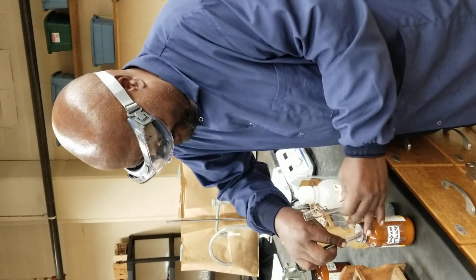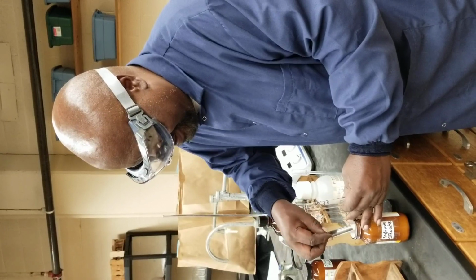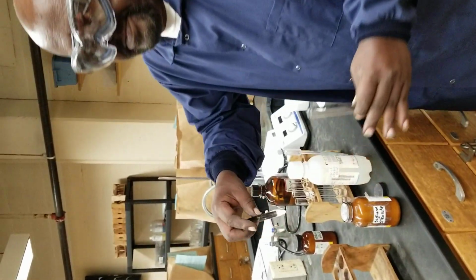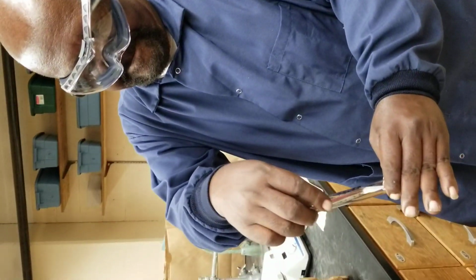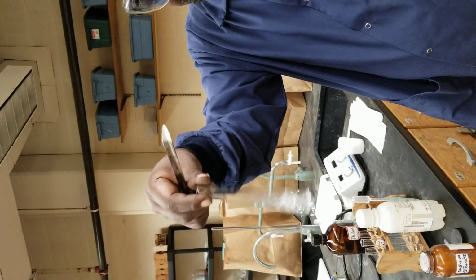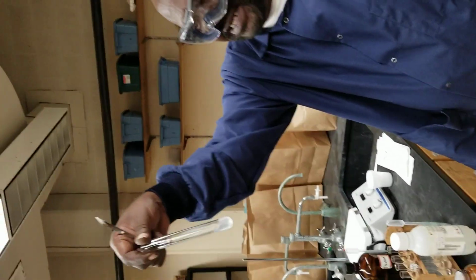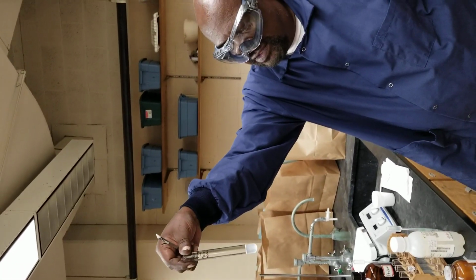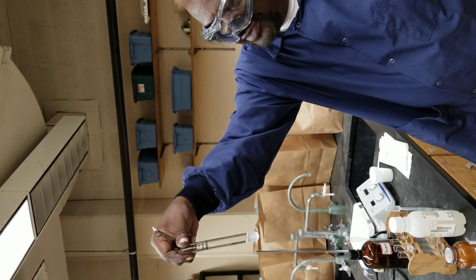A little bit. Come on, it's so powdery. That much sodium stearate. What is it going to give us, sodium stearate? It's a little cloudy, whatever it is, but I don't see any stuff sitting in the bottom or floating around.